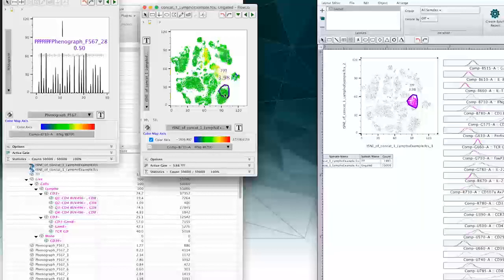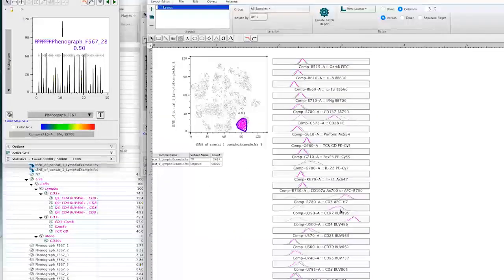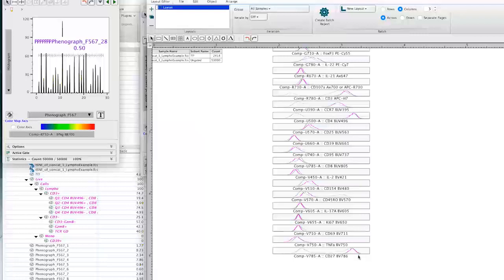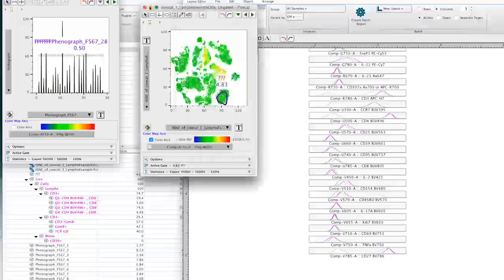So, you know, we can go over to this population and be like, well, what's that island? Well, that's a CCR7, CD4, CD3, CD28 population, but it's negative for RO and it's rocket high for CD27. And so, you know, we have a different subset and it positions itself differently within the dimensionally reduced data space. So now I've got all these clusters. What do I do with them, right?